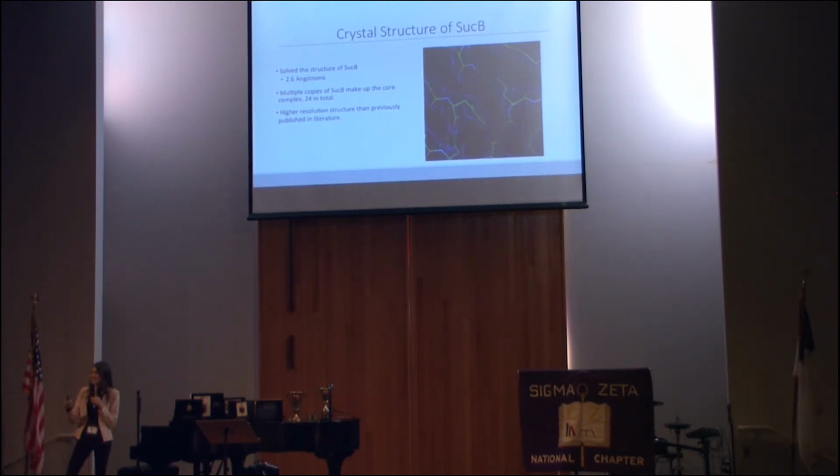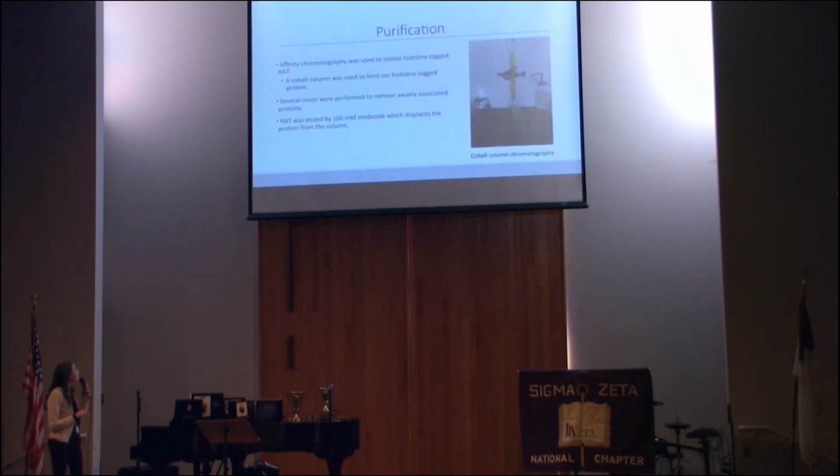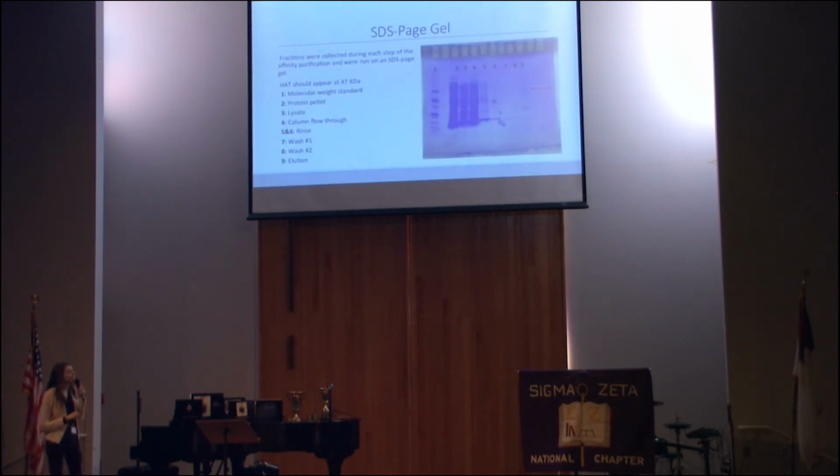Is there any other question? Come back here. Yes, we think so. I believe it actually is this one up here. This is a bad gel picture, but you do have a lot of protein in here, so it would be kind of hard to point out where it exactly is.